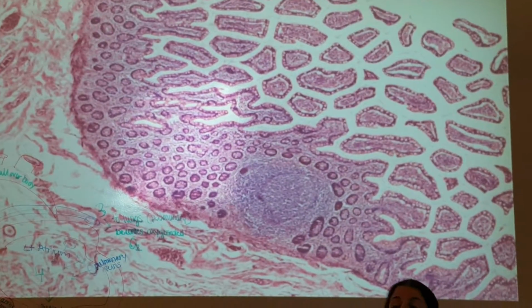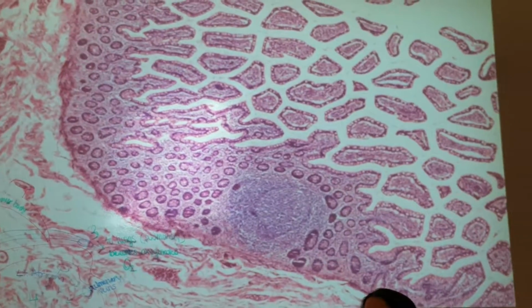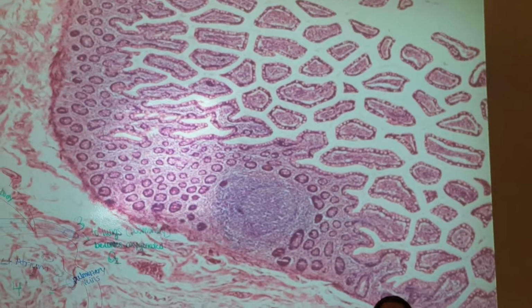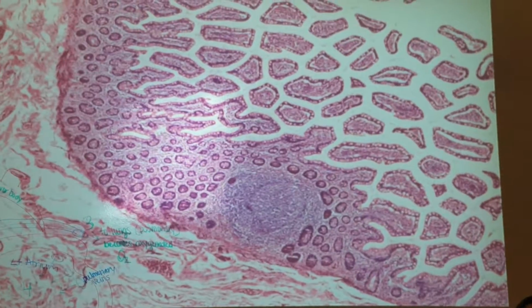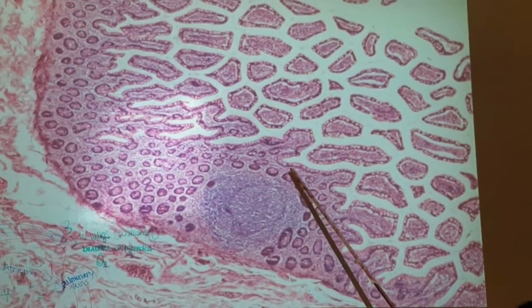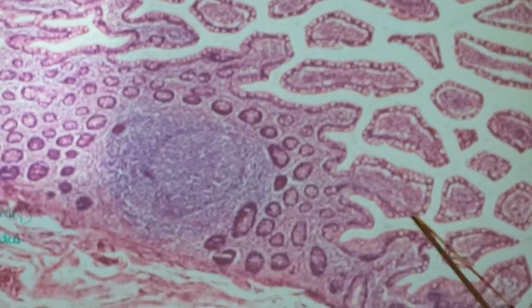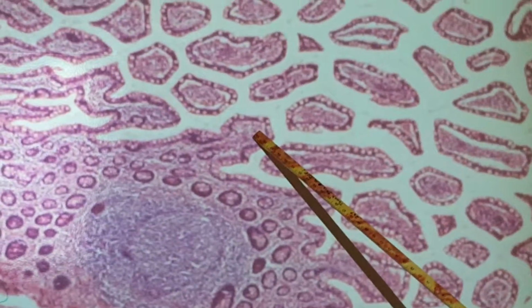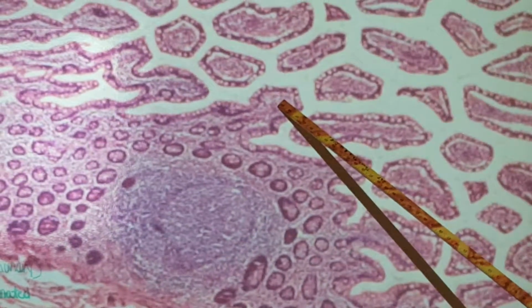So there is another thing. Instead of gastric glands, or gastric pits, because we're not in the stomach anymore, we're going to have villi, villus. These are pointed projections at the end of the pointer. Your hint page has it on this. It's going to ask for the pointed projections in the pointer. The pointed projections mean these extensions coming off of that mucosa layer. Any of these projections, it would have the pointer here and ask what's the pointed projection at the end of the pointer, and you're going to be looking for villus or villi.